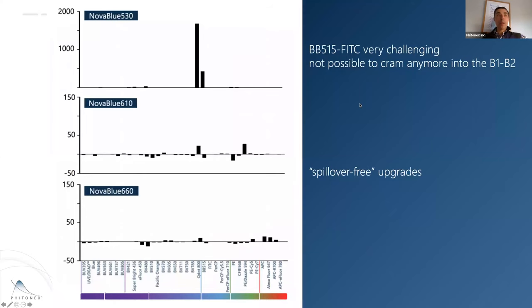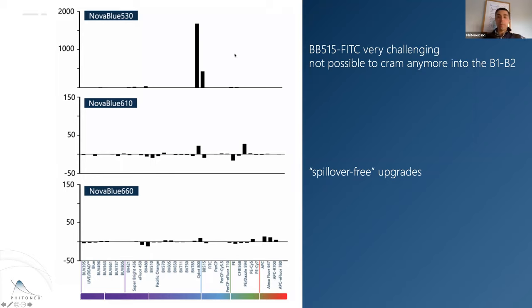The Nova Blue single-color drop-in showed a spillover spreading increase for BB515 and FITC because we're cramming the B1 and B2 channels. BB515 and FITC are very challenging together, which is why previous panels put them on alternating phenotypes. In this case, it's just not possible to cram both into B1 and B2. In our panel design, we dropped BB515 out to ameliorate this problem, moving the antigen elsewhere, which also removes other spillover characteristics in the violet from the brilliant blue dyes.